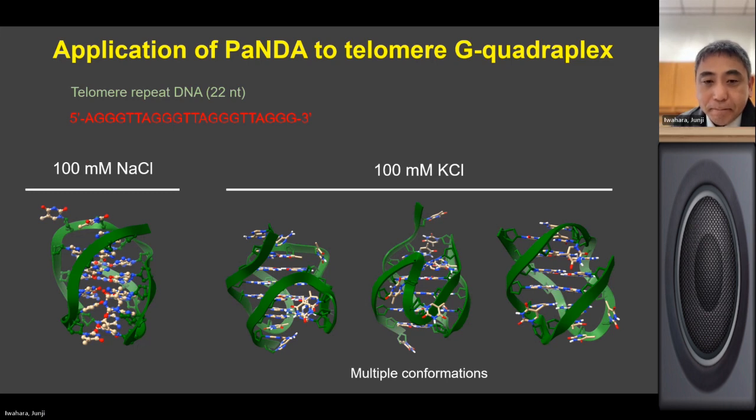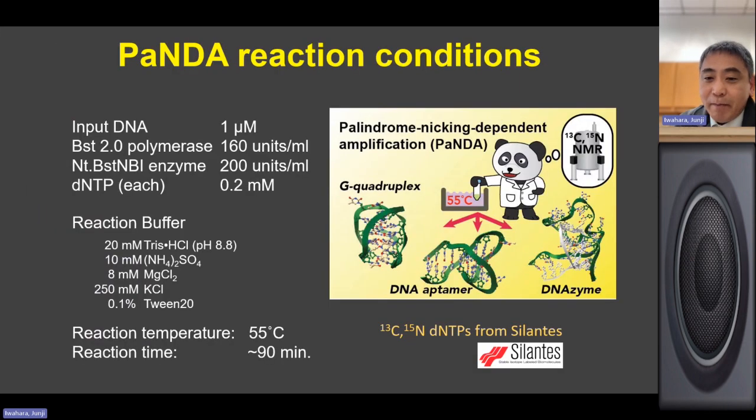Okay. Another question, coming from using T7 RNA polymerase: for each reaction we used to optimize the template concentration and the NTP concentrations. Now, we already talked about NTP concentrations. Is the template concentration very sensitive for production? No, but actually, we found that 1 micromolar is almost optimal.